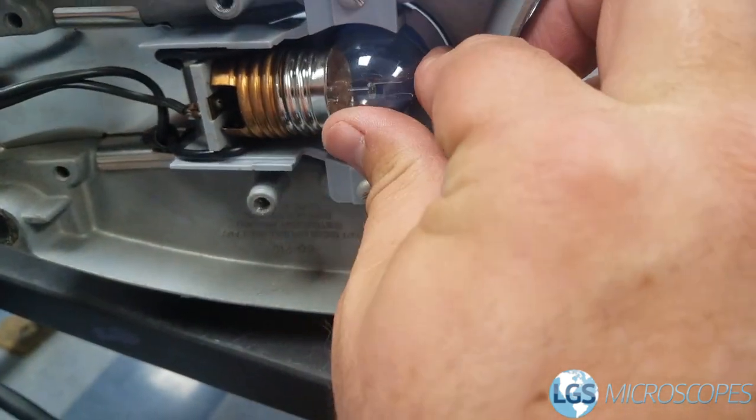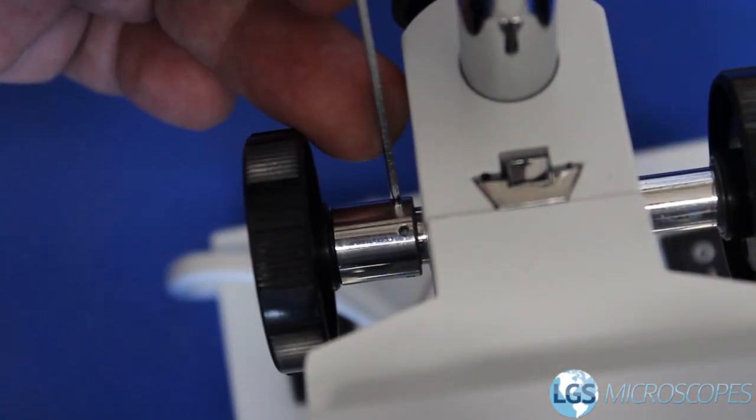Someone who can come in and periodically look under the hood, so to speak. This has just been a quick video on how you can take better care of your microscope on a day-to-day basis — it's not a substitute for having a microscope technician come out and clean it thoroughly periodically. If you ever have any questions or comments you can call us at 623-240-2232 or email us at info@lgsmicroscopes.com. Thanks and I hope this video was helpful for you.